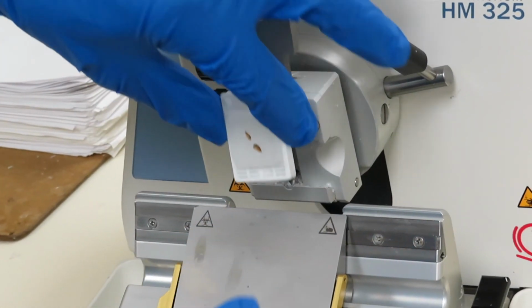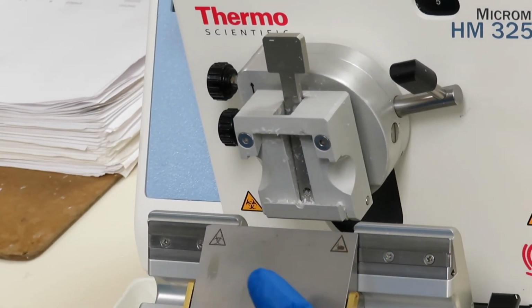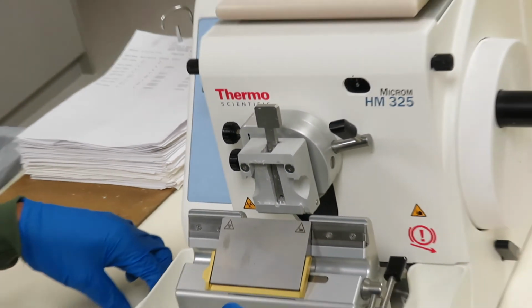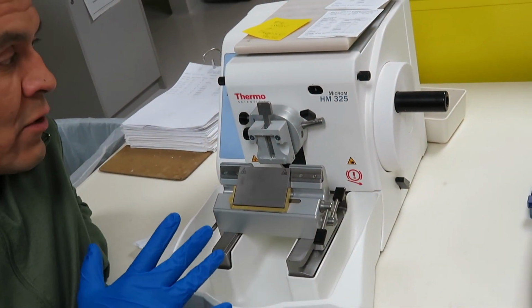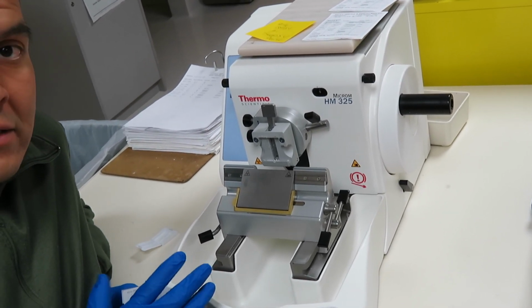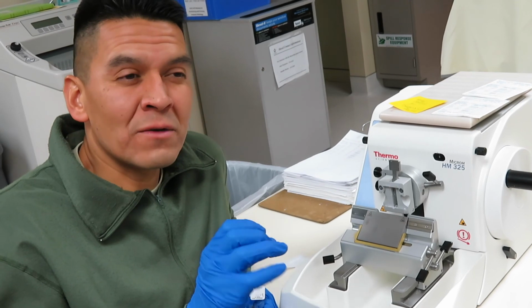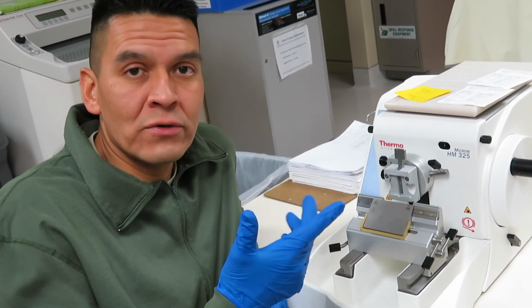So what they do is they insert the tissue block in there, and the blade here slices it, so it creates little wafers, little slices, and the thickness of that is anywhere from 2 to 4 microns in thickness. Just to give you an idea, a red blood cell ranges from 7 to 9 microns in thickness, whereas this cuts between 2 and 4 microns.